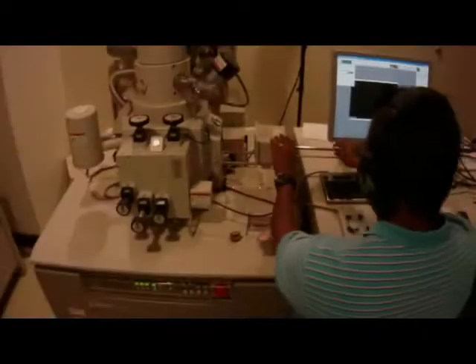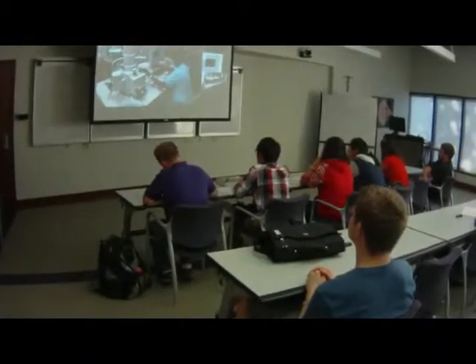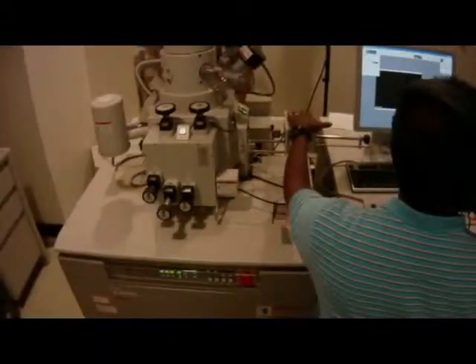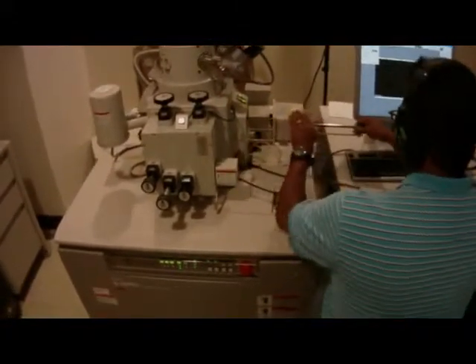The compartment here is where we are putting the sample. I'm lowering the sample into this, so it should work out fine. That door is closed, so you can't put anything in.